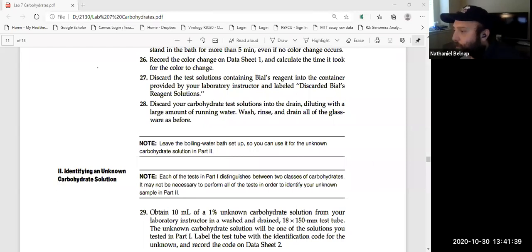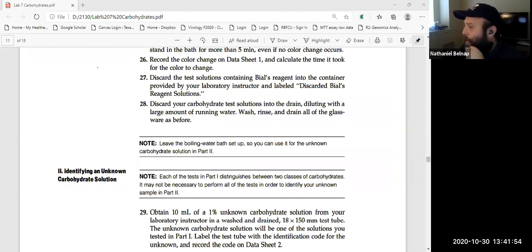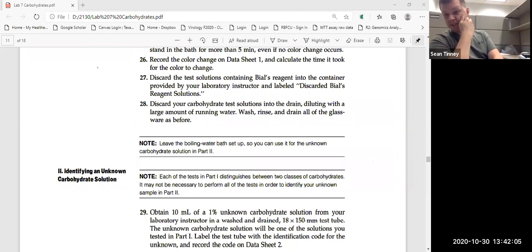Oh, here, is it this one? I thought we're doing 0466. No, we're doing 0446. Qualitative. 0446. You're right, Trey. Barfoed's, you have to wait a full 10 minutes for a full reaction. Or 2 to 3 minutes, but it's not like positive. You still have to monitor for a full 10 just to see if there's a change for the final disaccharide.